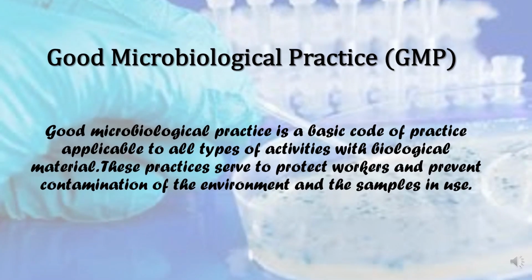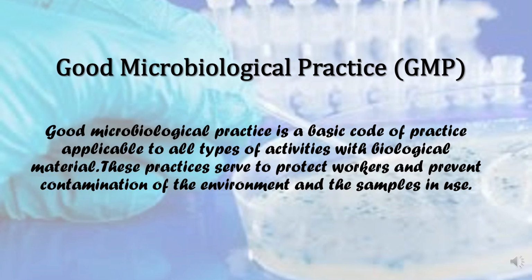Good microbiology practice, or GMP, comprising aseptic techniques and other good microbiological techniques or practices, is of utmost importance to prevent contamination of the laboratory when handling microorganisms. GMP employs microbiological lab techniques, or microbiology lab procedures, to keep the research materials, microorganisms, in their safe place without coming in contact with other organisms, and also keeping the safety of the people around in mind while experimenting. The ultimate goal of GMP is to extract the research result without any adulteration or contamination.